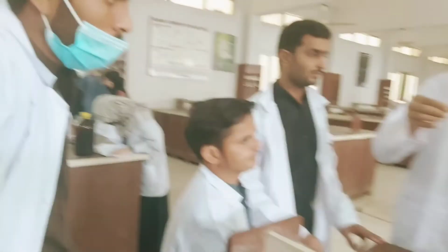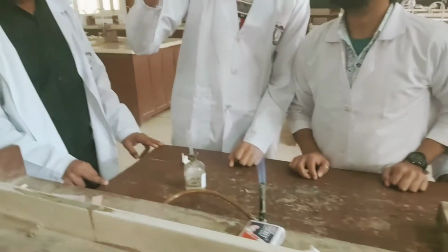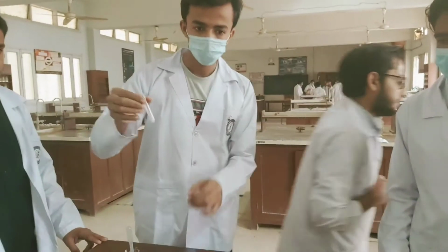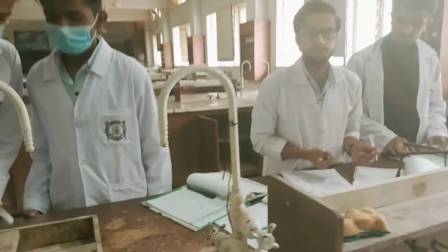It's not soluble in carbon tetrachloride. It's soluble in chloroform but not soluble in carbon tetrachloride. Record your findings. And I also check whether it dissolves at room temperature or on heating.